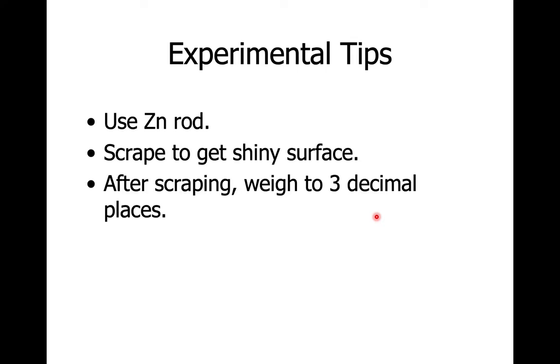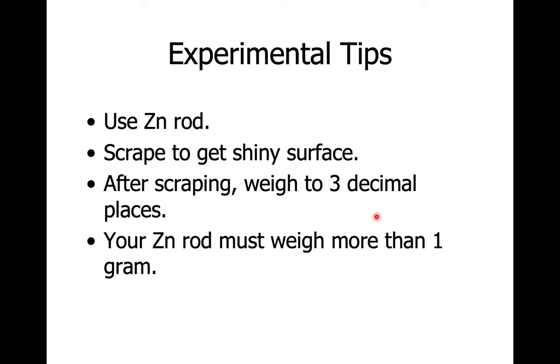After scraping, you want to weigh to 3 decimal places and record that weight. Your zinc rod must weigh more than 1 gram. Okay? That's in order to ensure that it will be the excess reagent. We want to have more than enough zinc there.